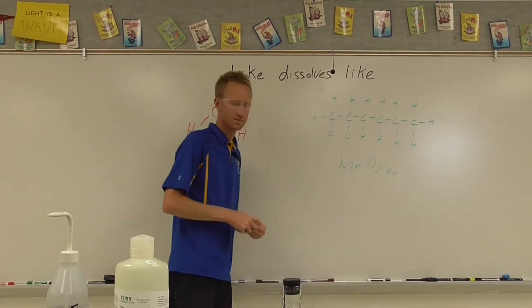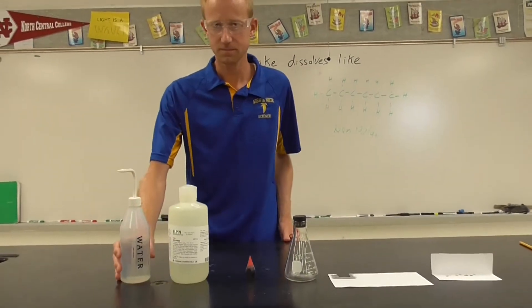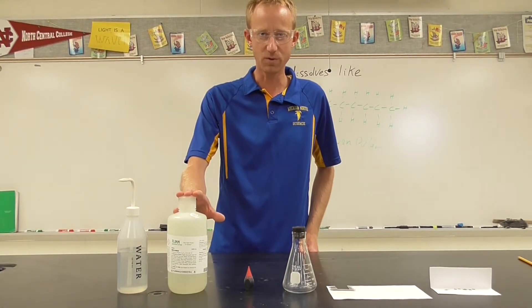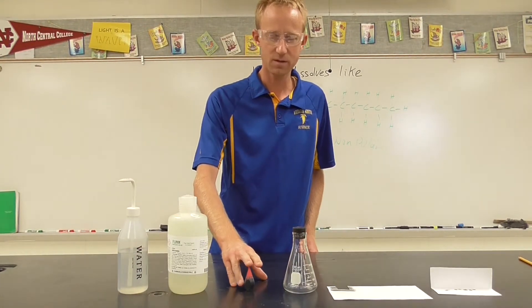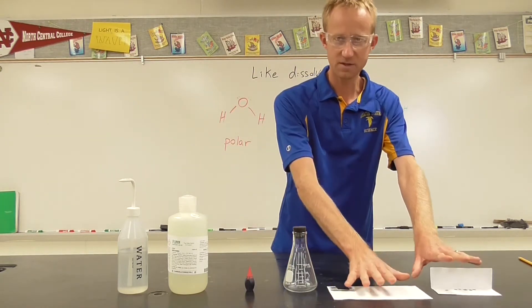So on the lab bench in front, we have those things. We have water, which is polar, hexane, which is non-polar, some food coloring, and an Erlenmeyer flask that's been stoppered.